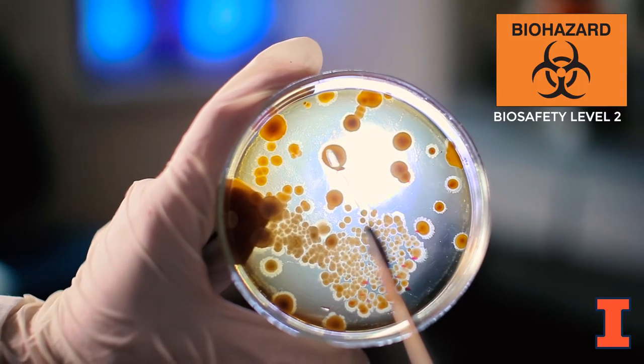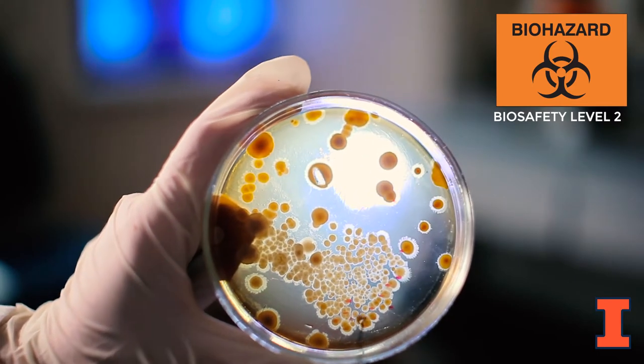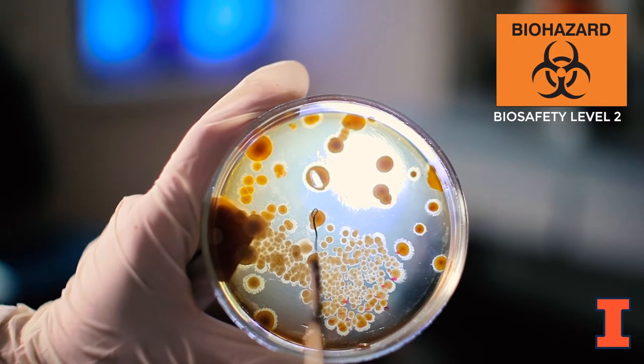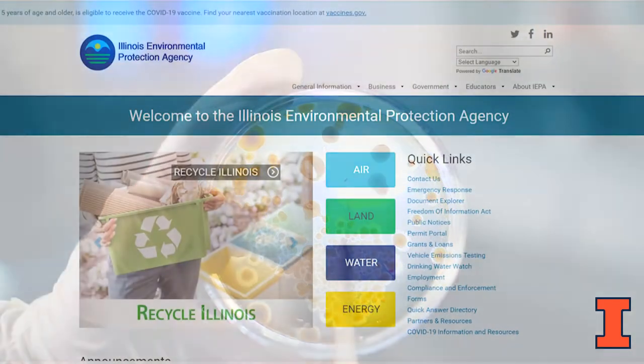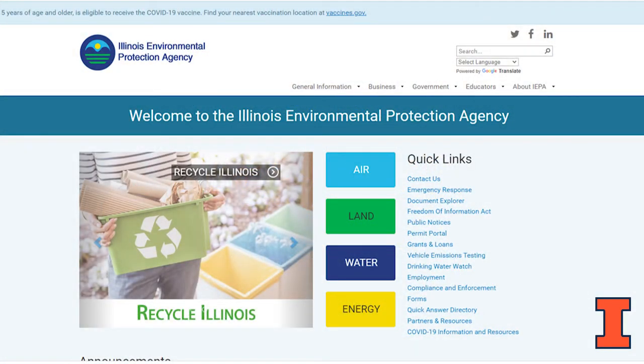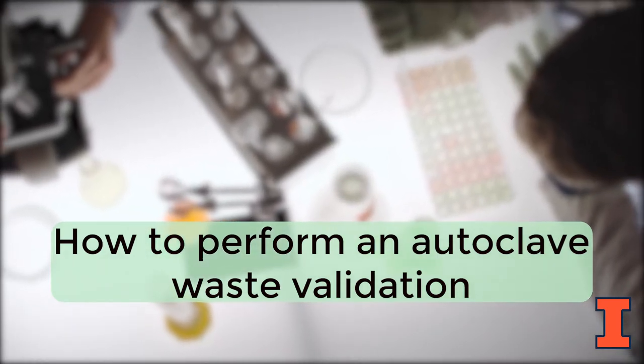The autoclave waste validation program is in place to ensure that potentially infectious biological waste generated by labs operating at biosafety level 2 has been effectively treated prior to disposal into the regular waste stream. According to Illinois Environmental Protection Agency, anyone generating and treating infectious biological waste by autoclave shall perform and record validation results at least monthly. This video will provide a demonstration on how to perform the waste validation using spore vial indicators and how to log the results on the Division of Research Safety website.